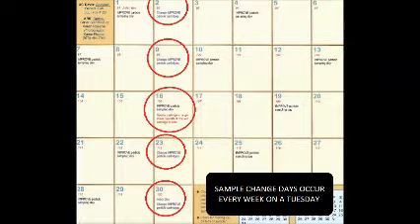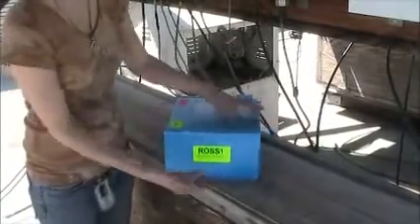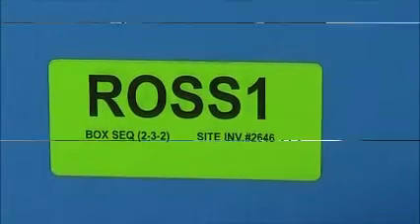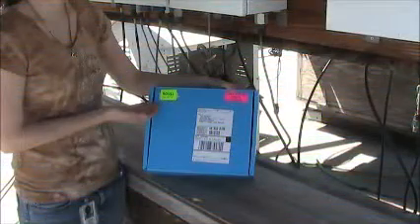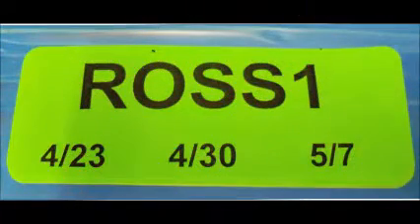You will receive a blue box about every 3 weeks. The site code is listed on 2 sides of the blue box. This is the code you will need to provide AQG staff if you call with an issue regarding your site. There is also a sticker on the top left of the face of the box that has the site code and the 3 installation dates for the box. Make sure that the dates on the box are correct for the current sampling period.